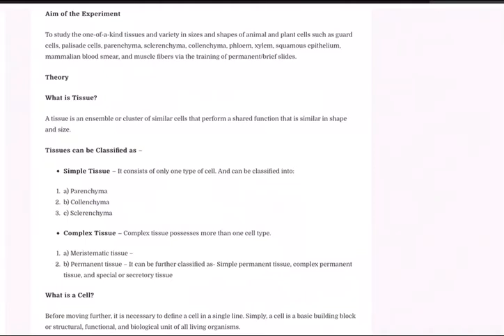As you know, along with the theory we go hand in hand with the practicals also, as you need to perform practicals and the weightage is 30 marks. And one of the experiments that you need to perform is observing the permanent slides, identifying those slides, writing important characteristics or features of that slide and drawing the diagram. So to increase our efforts in that direction, in this session we are going to do the animal tissues experiment, or rather plant or animal tissue experiments.